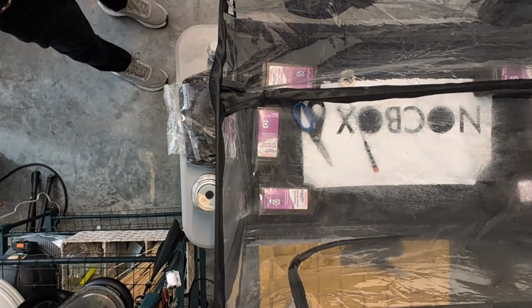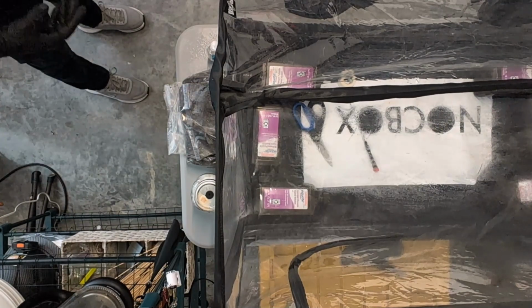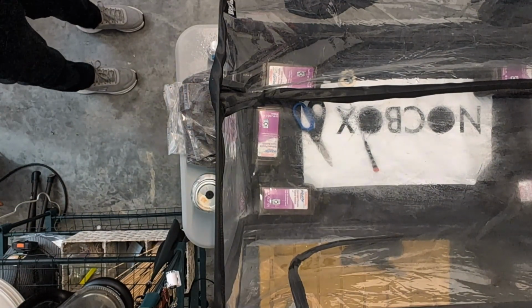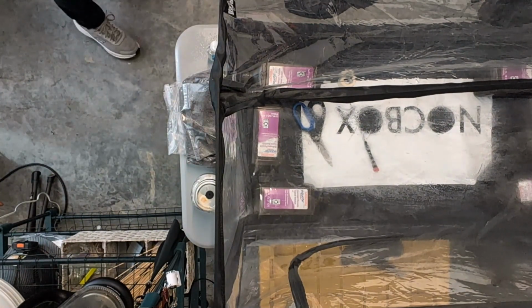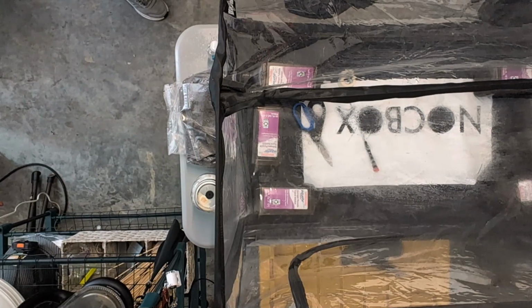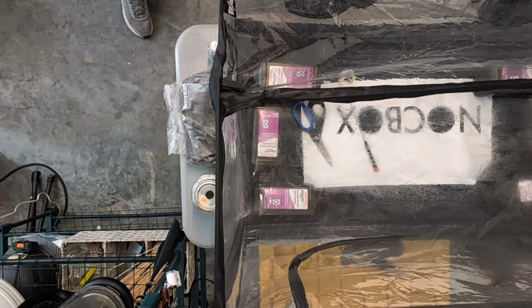Back to sanitizing, and you'll notice that I'm saying sanitize and not sterilize whenever I'm wiping this stuff down. The reason is that sterilization is an order of magnitude more extreme than sanitization. I'm sorry if I'm preaching to the choir here, but just to clarify for people that maybe don't know, in sanitization, you're just trying to get it as clean as you possibly can. The objective is to do your best. Get it as clean as you personally can. The cleaner, the better, the more sanitized.